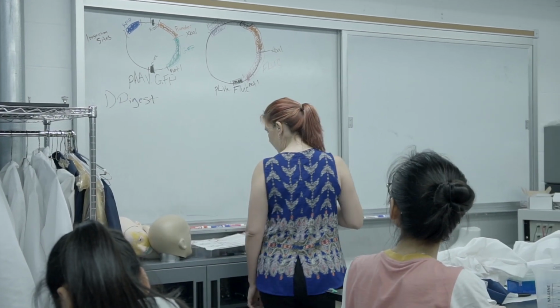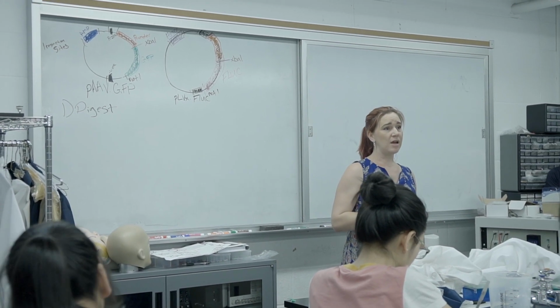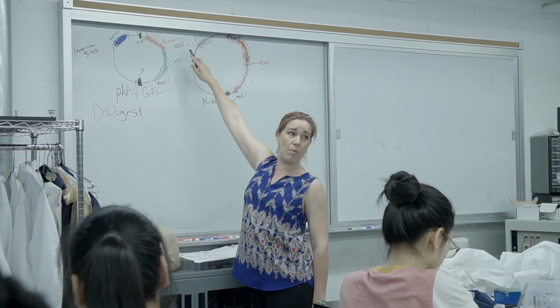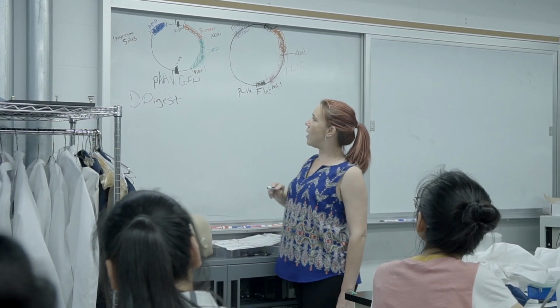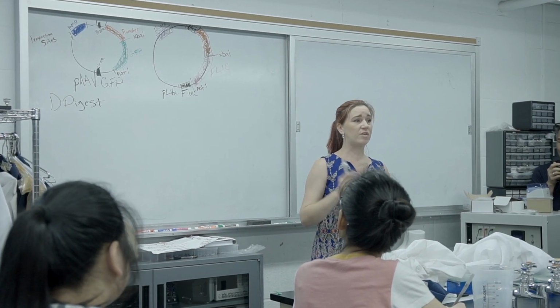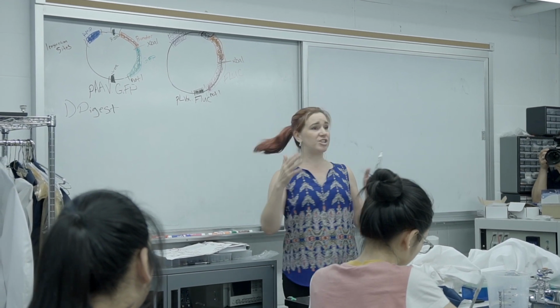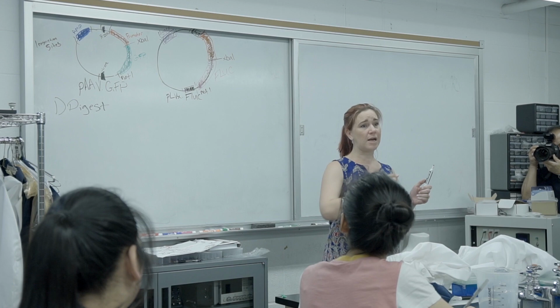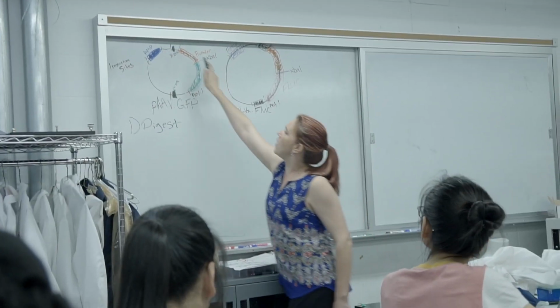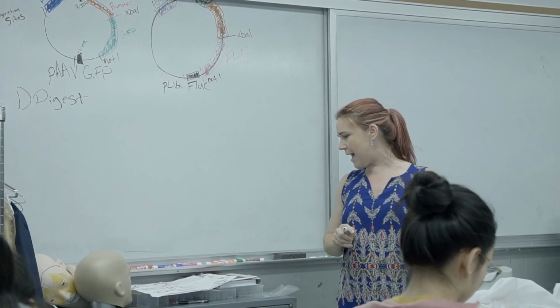And you don't have to, but it's always easier when you can use the same restriction enzymes on your 2 separate plasmids. So I'm going to use one that's very common called XbaI and another one called NotI. And I double checked in my sequences and I made sure that there's only one cut site of each of those. So we will do a reaction much like you did. So we only put in one enzyme today, but you can put in multiple enzymes. And I'll have 2 tubes, one with my AAV plasmid and one with my lenti plasmid.